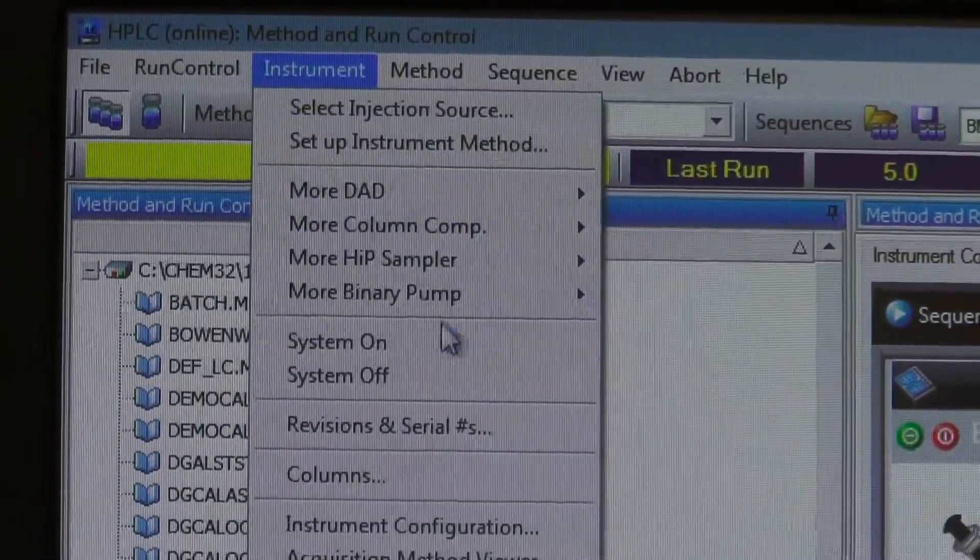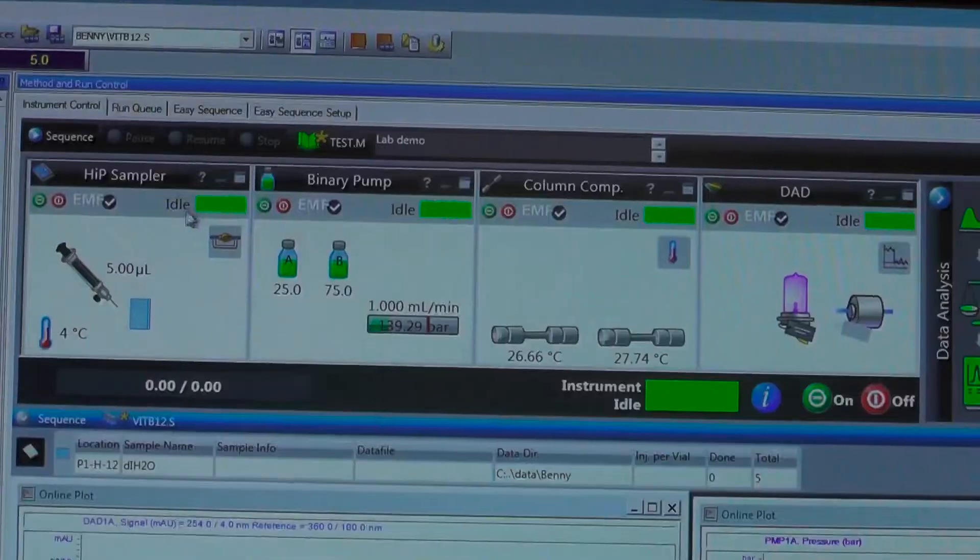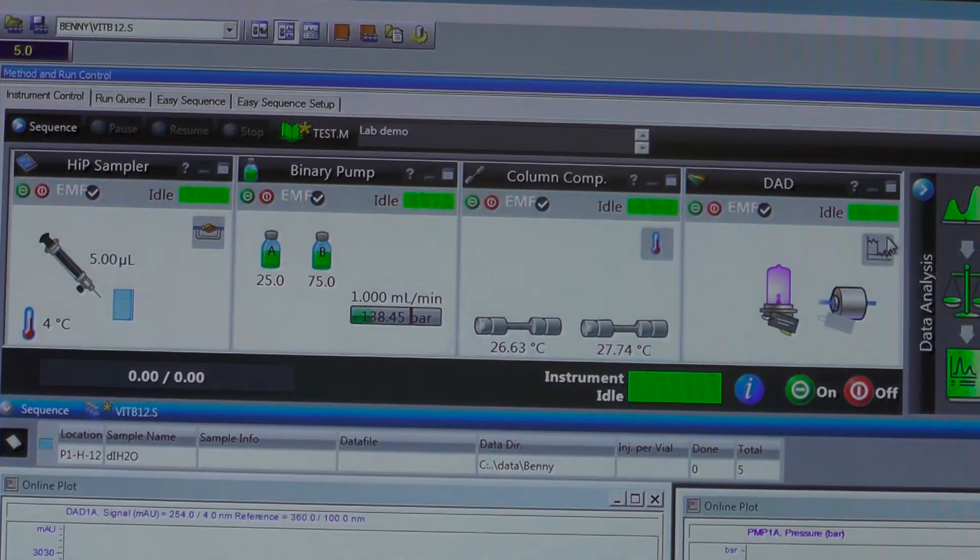Click on the Instrument tab and choose System On. Wait until all green lights are on, as shown here.